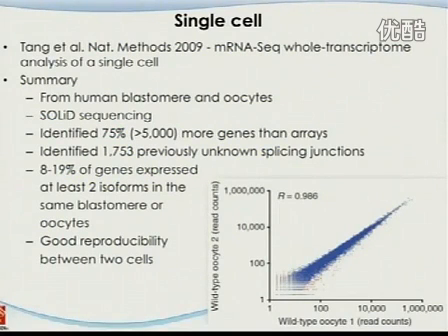And actually, we had some experiments working with the UCSC group. They also work on single cells. And our correlation between 2 cells, 2 individual cells, is 0.7, 0.6. Okay? And I don't know how they achieve this high sensitivity.